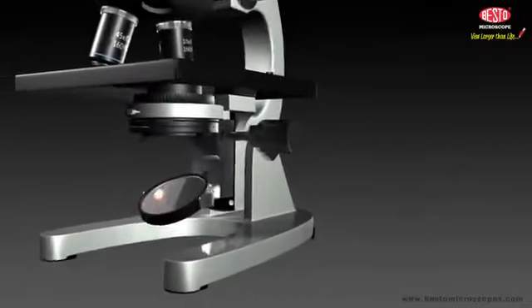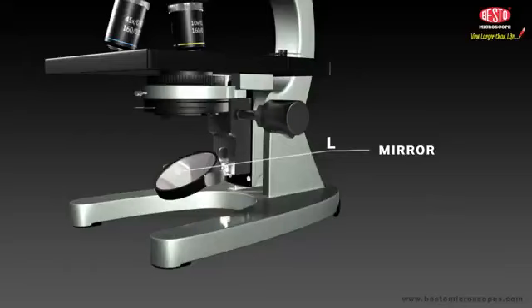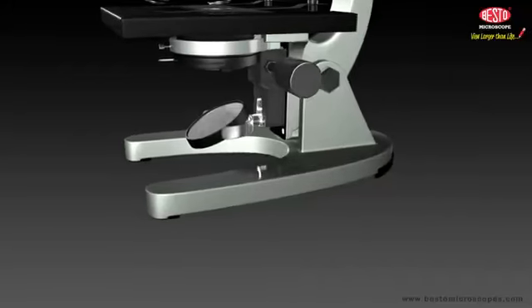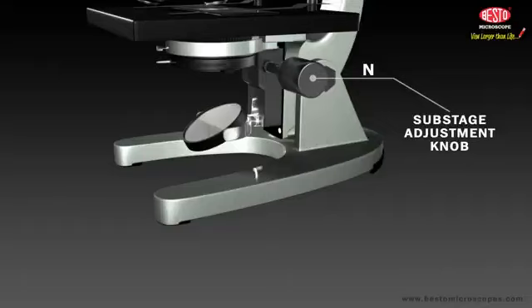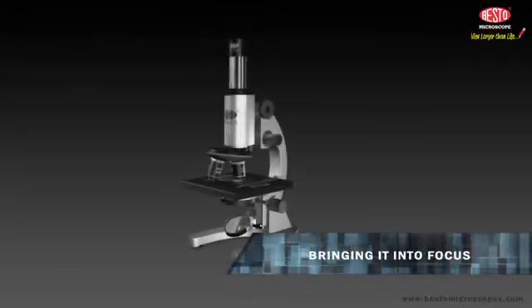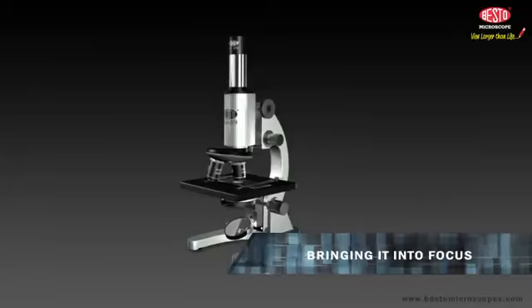L. The mirror, located beneath the stage diaphragm, increases the amount of light shining through your sample or slide. Sometimes we use a lamp plugged into an electrical outlet instead of a mirror or reflector. M. The base of the microscope is the heavy bottom part. It supports all the other parts of the microscope. N. The substage adjustment knob is used to move the condenser up and down, bringing it into focus. You're probably anxious to get started using your microscope.